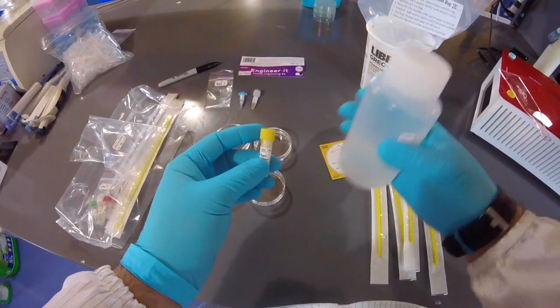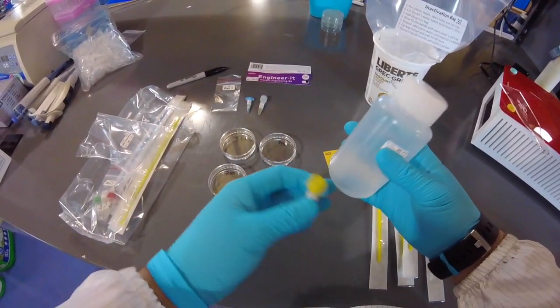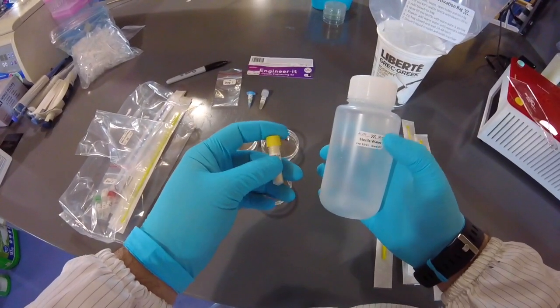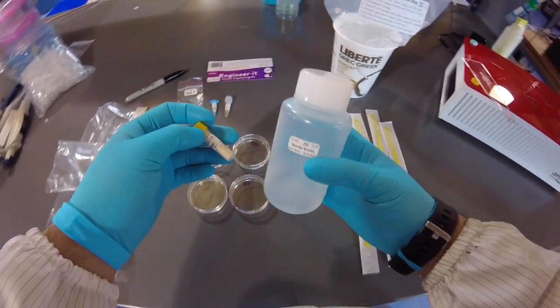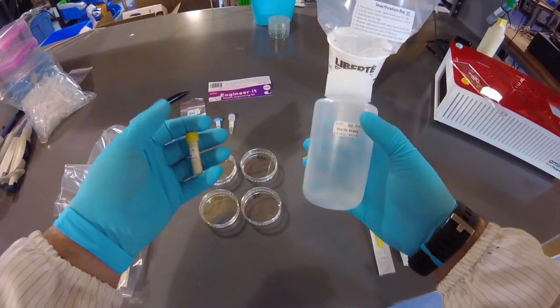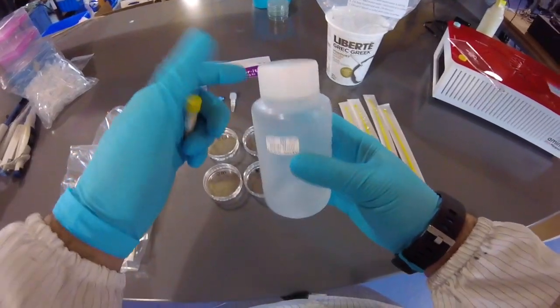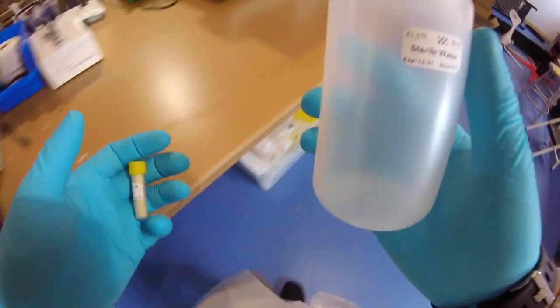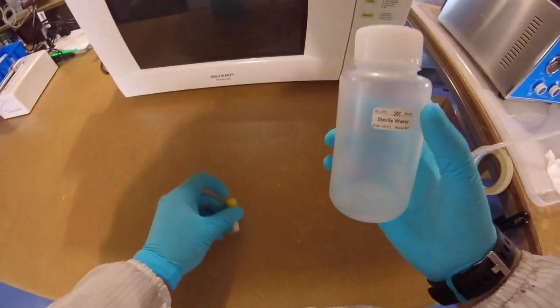And so that's really hot. And also when you add the powder to the water when it's boiling, that cools it down. So that's why you need to have hot water, okay? So can't stress that enough. You can't just pop it in the microwave and take it out in 45 seconds, pour it in and expect it to work. You definitely need a rolling boil, and we'll see that momentarily. So let's go do that right now. So I've got a regular microwave.